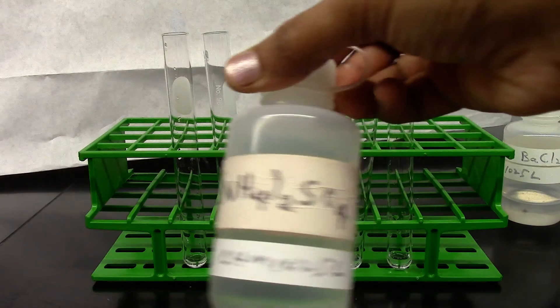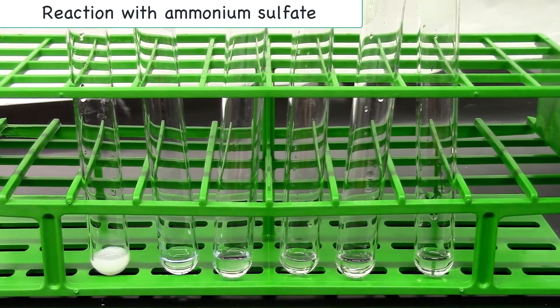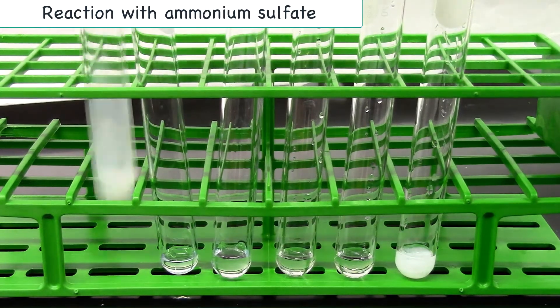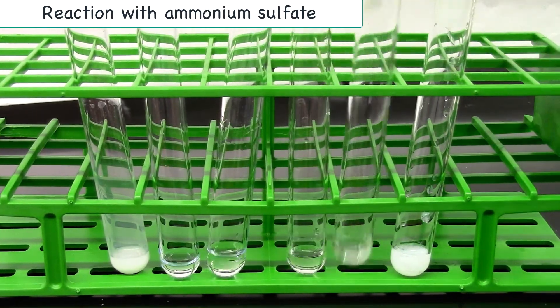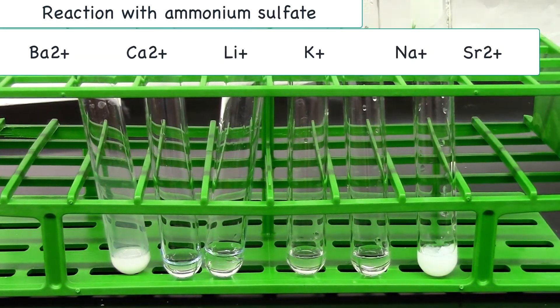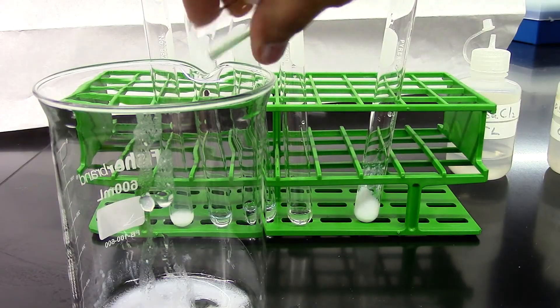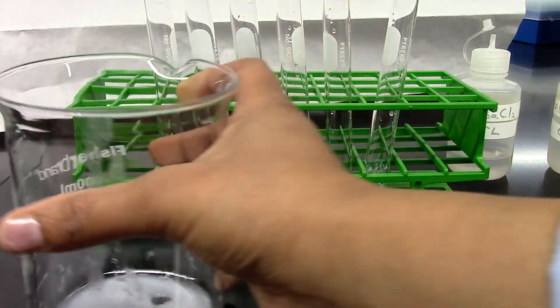To each of these test tubes I'm going to add a few drops of ammonium sulfate. I'll give it a mix. Record your observation. I'll dispose all the solution in a beaker and then all the contents of the beaker go to a labeled waste bottle.